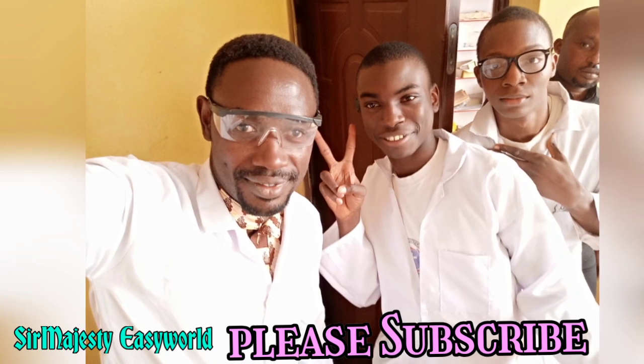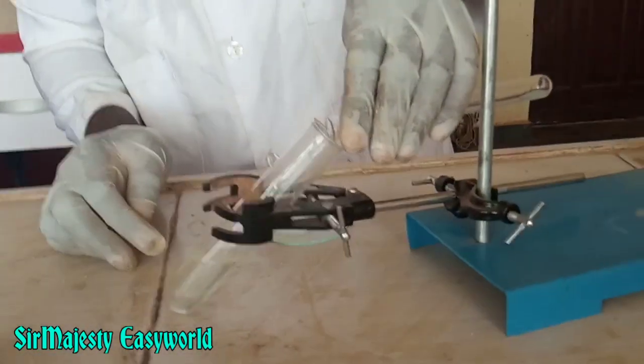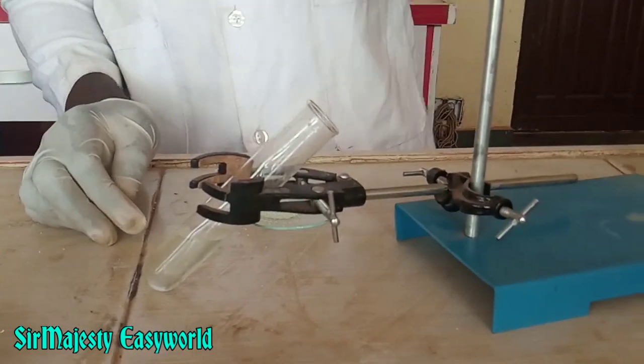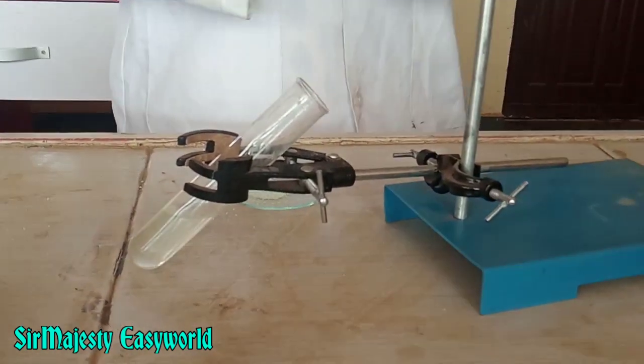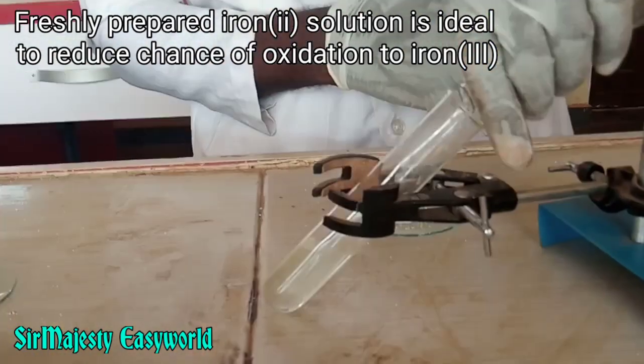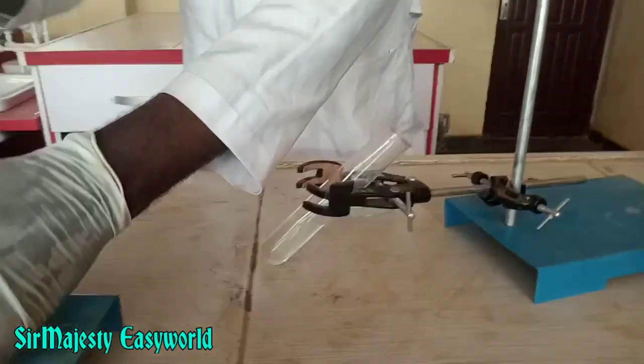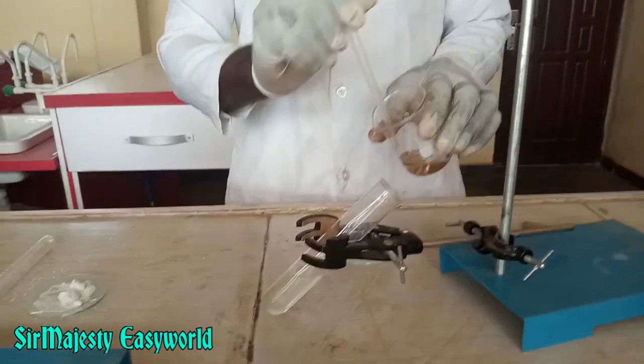Add the iron(II) sulfate to the acidified test solution and allow to mix well. Freshly prepared iron(II) sulfate is used to prevent the oxidation of iron(II) sulfate to iron(III) sulfate, which is not suitable. The best is iron(II) sulfate, which is a reducing agent.